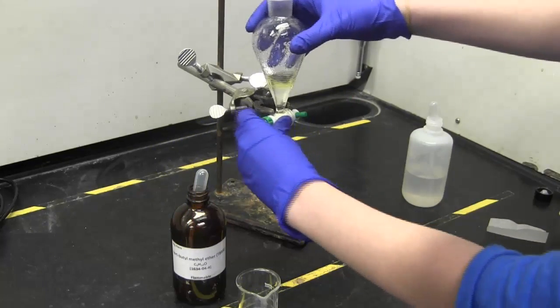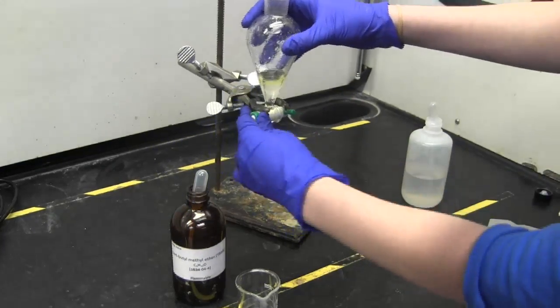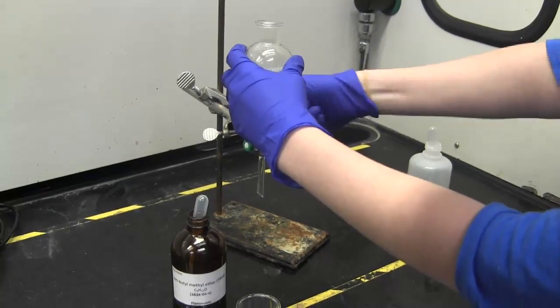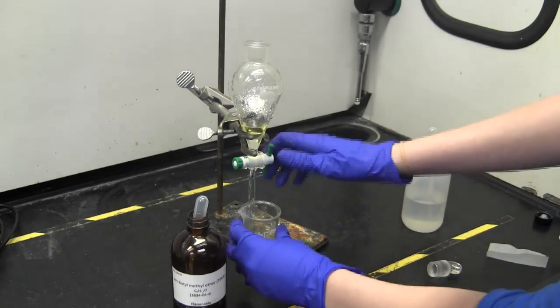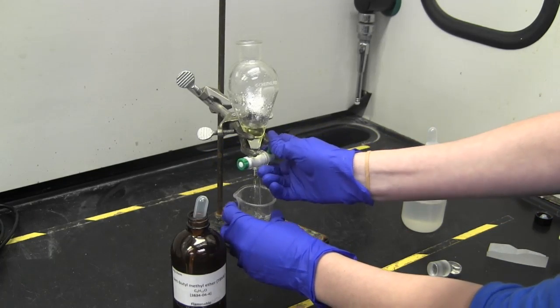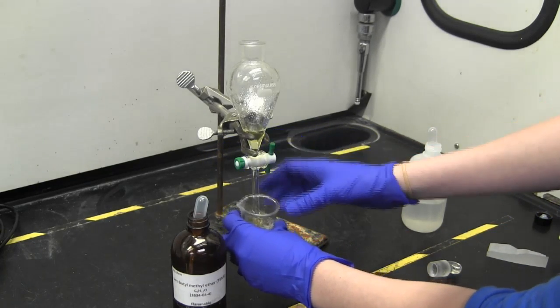Return it to an upright position and take the stopper off of the top. Then allow the layers to separate and open the stopcock slowly to allow the bottom layer to fall into the beaker below. Close the stopcock and repeat until you have reached the desired amount of washes.